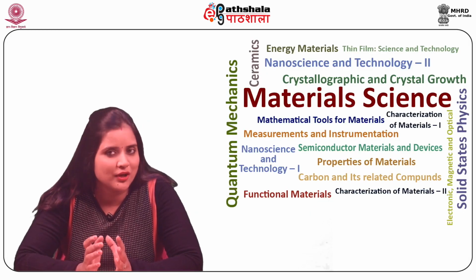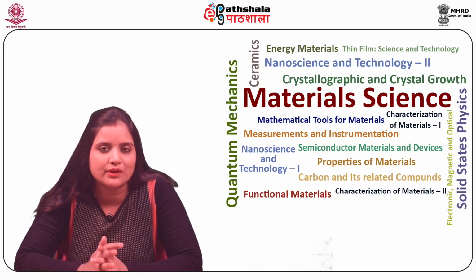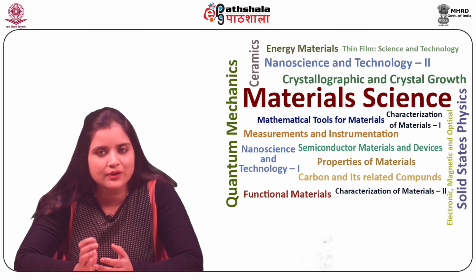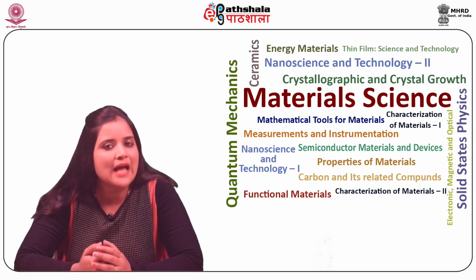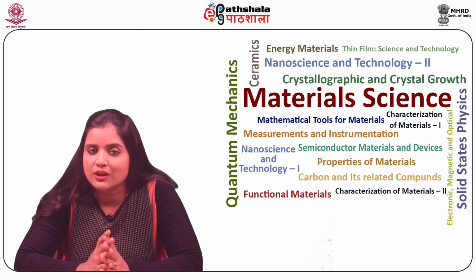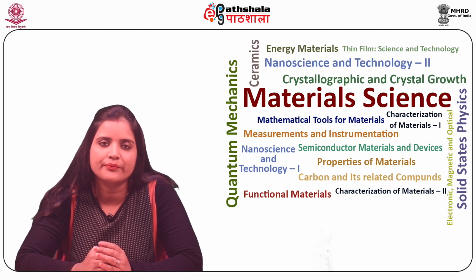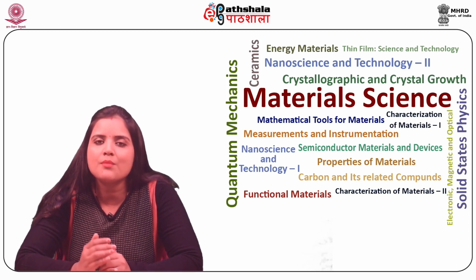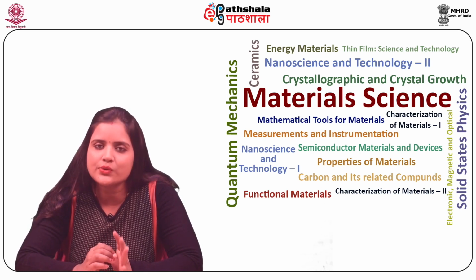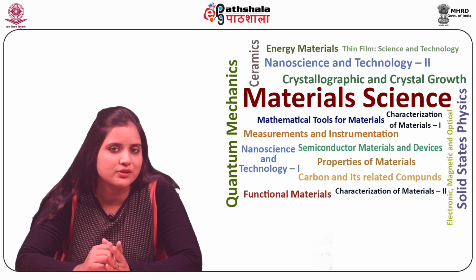The formation of an image using fluorescence is referred to as fluorescence microscopy. The setup could be simple, resembling an epifluorescence microscope, or complex, like a confocal microscope that uses optical sectioning to obtain superior resolution of the fluorescent image. Eric Betzig, William Moerner, and Stefan Hell developed super-resolved fluorescence microscopy, bringing optical microscopy into nano dimensions.